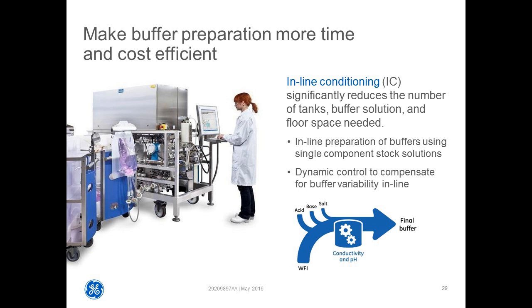What inline conditioning basically means is that you prepare or formulate buffers on the fly from four basic stock solutions: acid, base, salt, and water. Depending on the recipe you have in place, you're able to get to your final buffer right away. The inline conditioning logic or algorithm is intelligent enough to accommodate variations in your input parameters and still generate the output that you want.